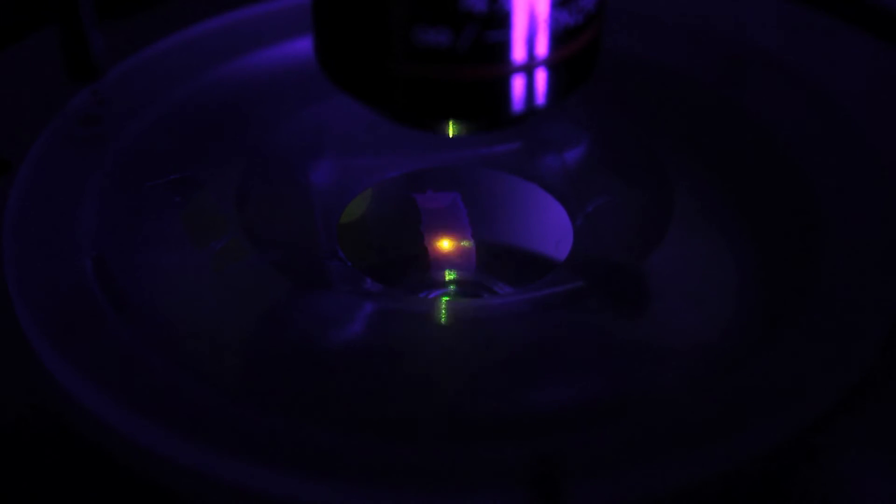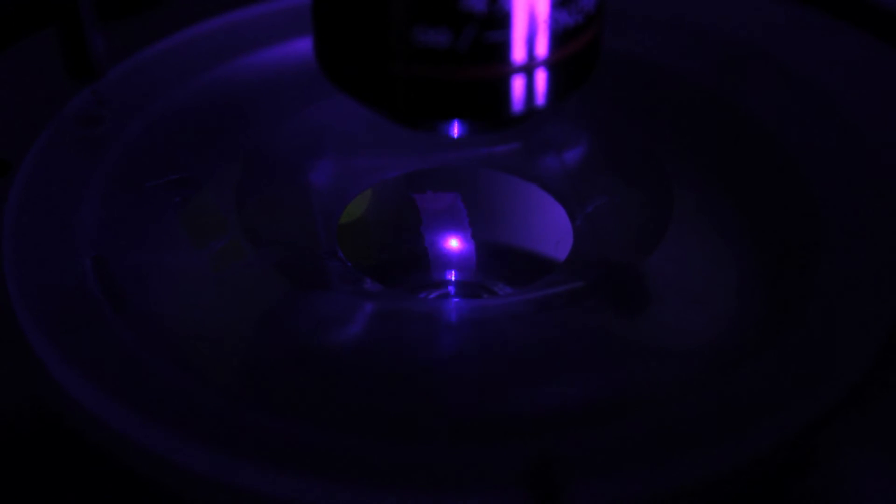Like many of Scientifica's products, LASSO has a modular assembly. This means you can upgrade your current Slyscope and include contrast techniques as required. Choose one or more laser wavelengths depending on your research and add more as your experiments develop.